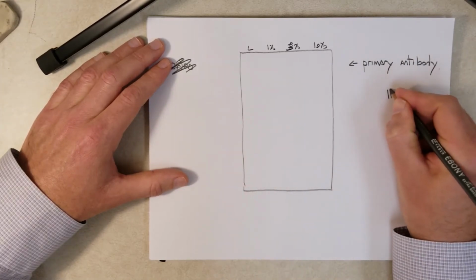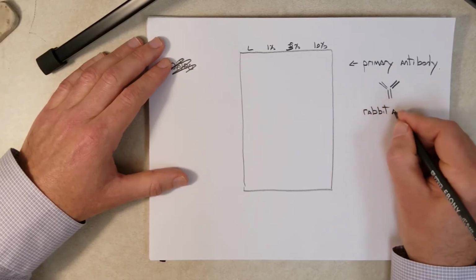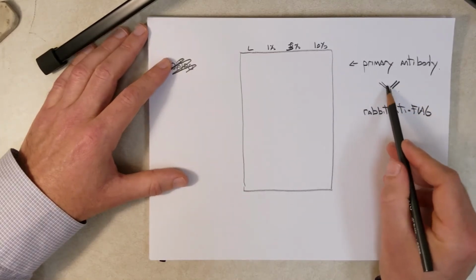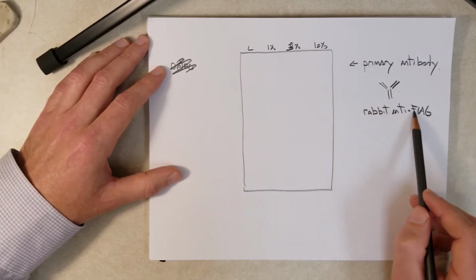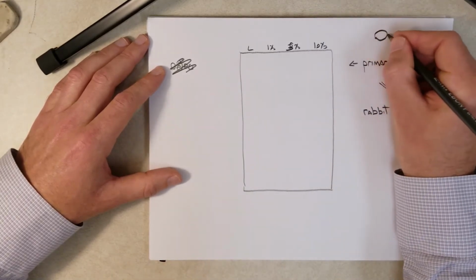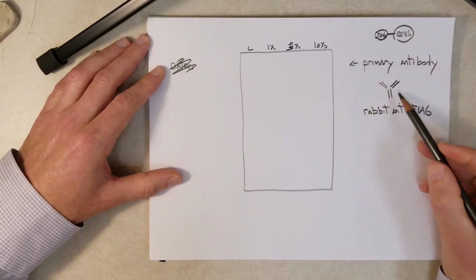And what is the primary antibody? In this case, it can be what we call a rabbit anti-flag antibody. And this is just a general structure of an antibody. We're going to cover these in a lot of detail in upcoming lectures. So this is called a rabbit anti-flag antibody. It's an antibody that binds the flag epitope. Now remember, the protein we're interested in has the flag epitope on it fused to CDC45. So our antibody is going to detect this.